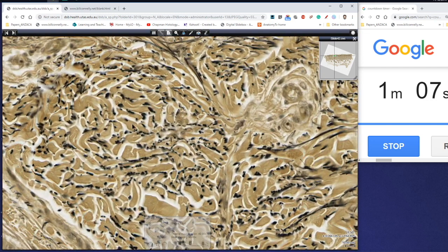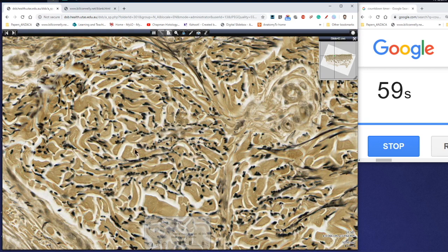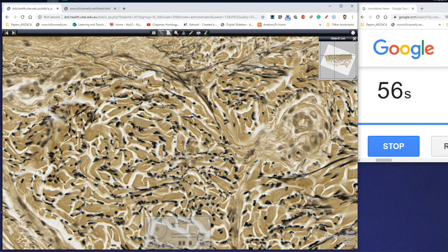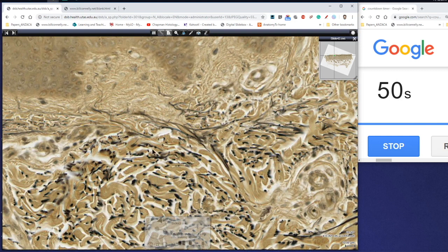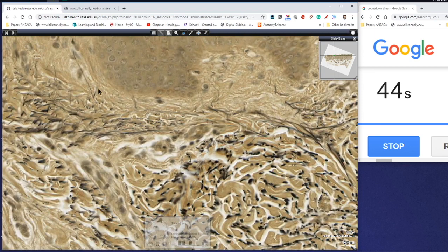These browner type of structures are actually the bundles of collagen. And you can see that with almost every collagen bundle there's also an accompanying elastin bundle. That helps to regulate how stretchy that type of connective tissue is. You can see how the thick bundles of elastin then become individual single fibers within the loose connective tissue.